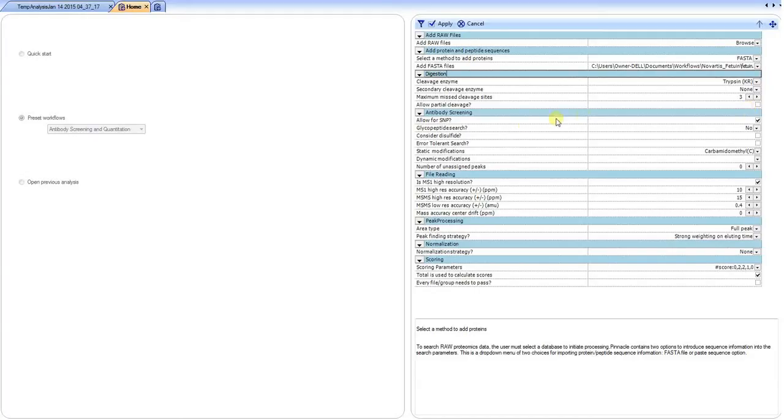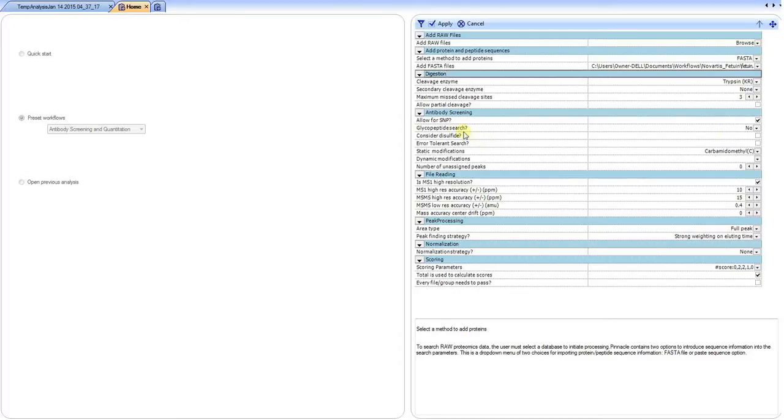Then the specific aspects for the protein screening. In this case we select SNP. For this experiment, we're going to do it without the considerations of N-linked glycopeptides or dynamic modifications.